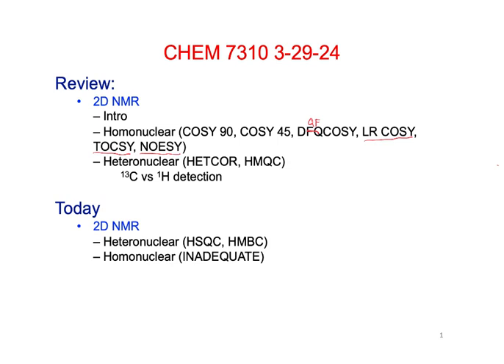So the NOESY is the NOE. And there's another version of this NOESY, which is called ROESY, for rotating frame nuclear Overhauser effect spectroscopy.